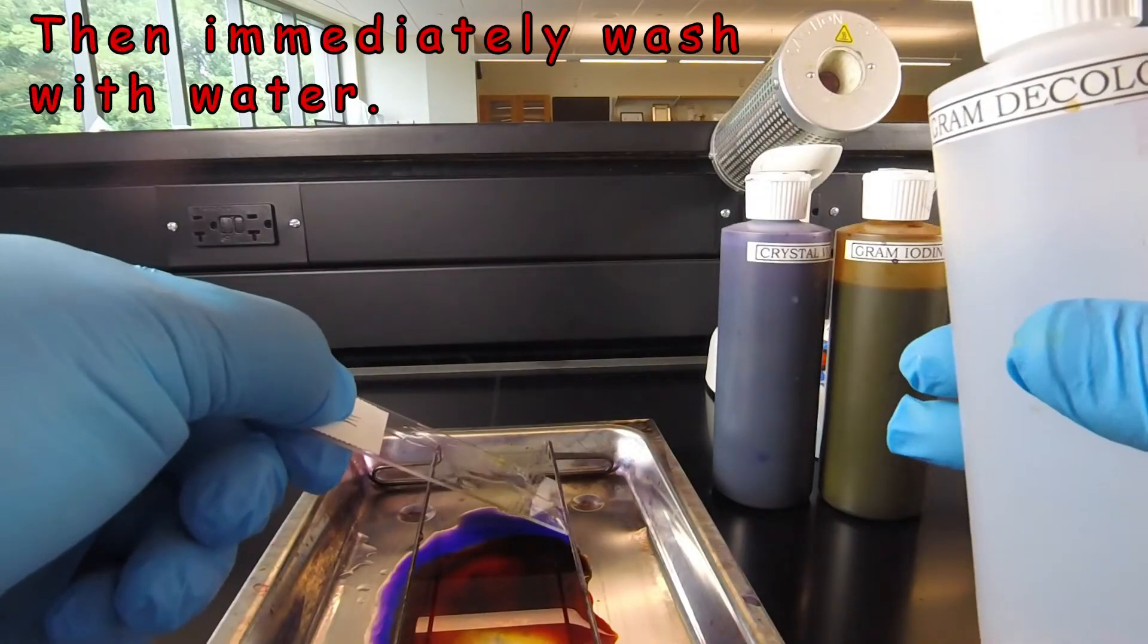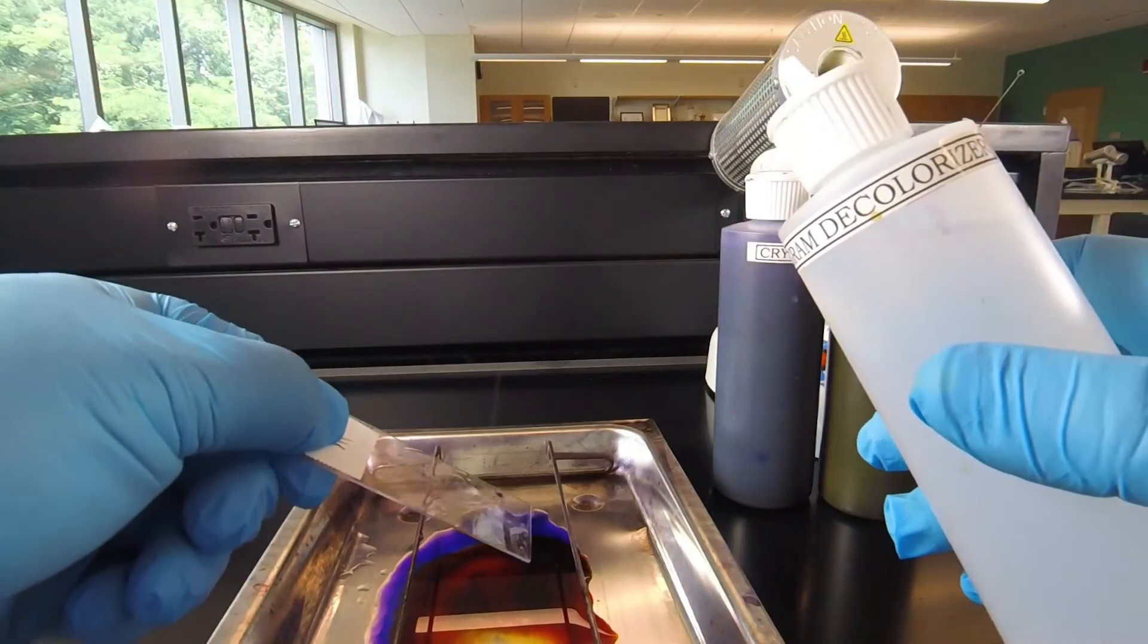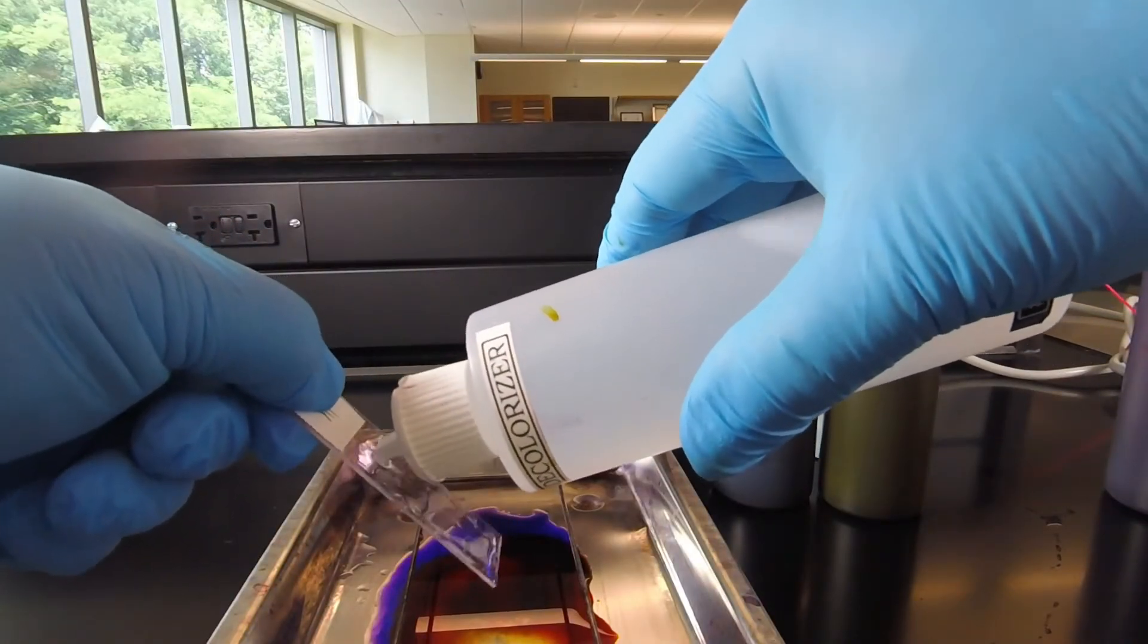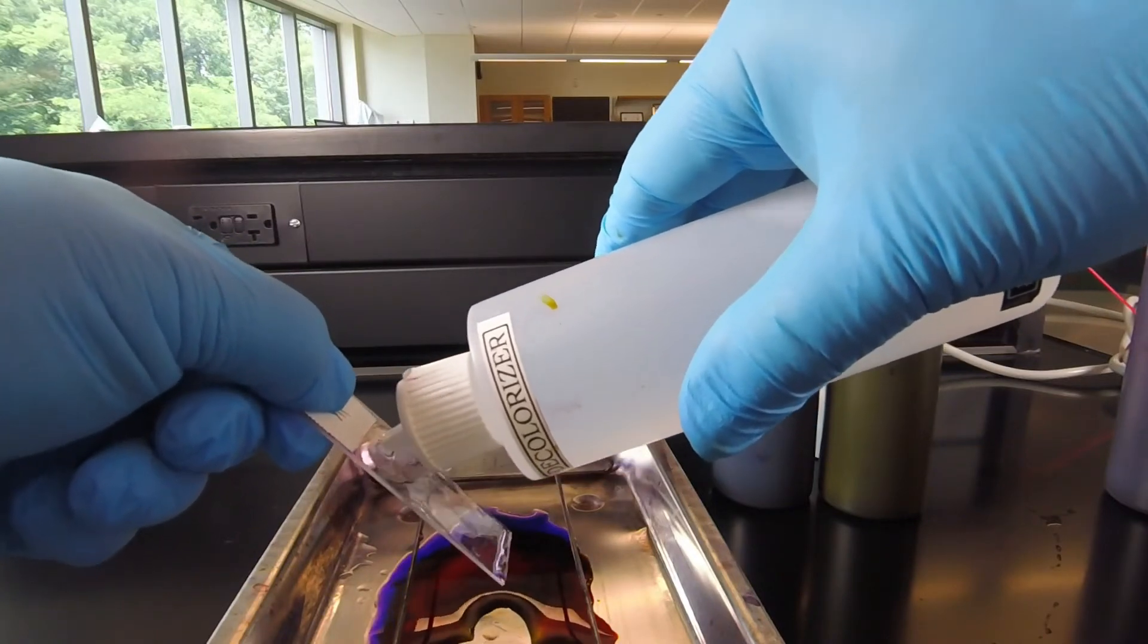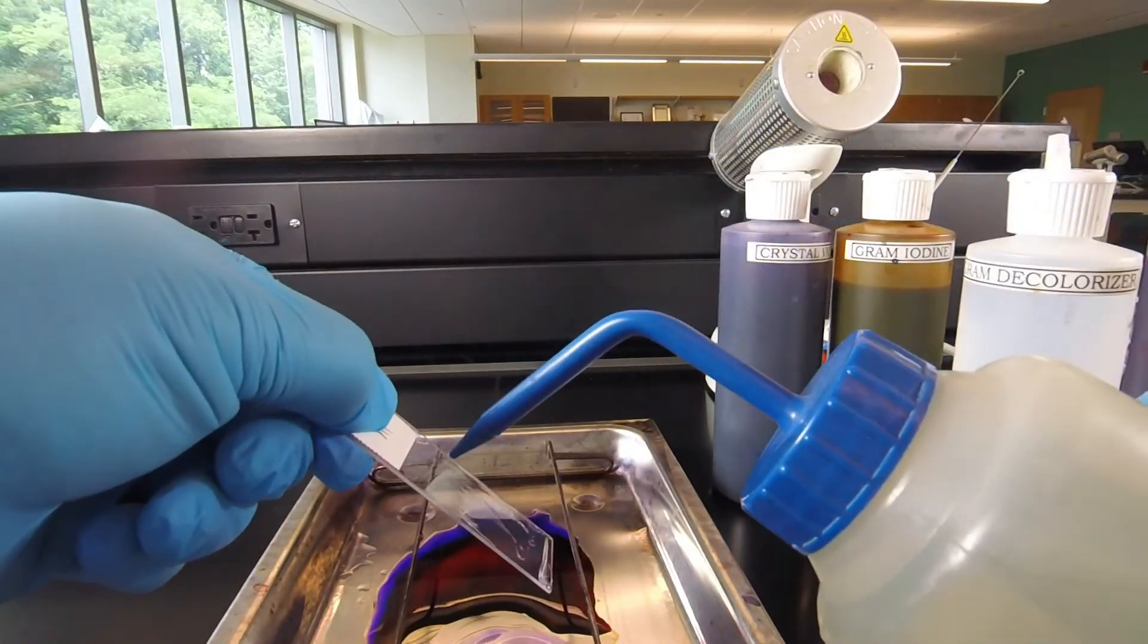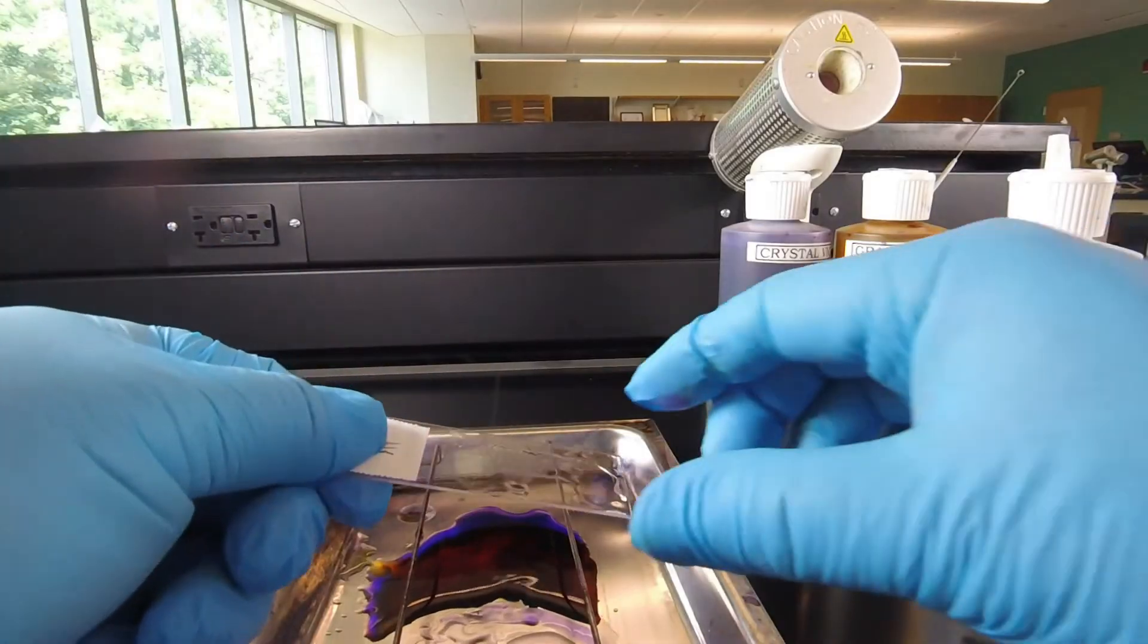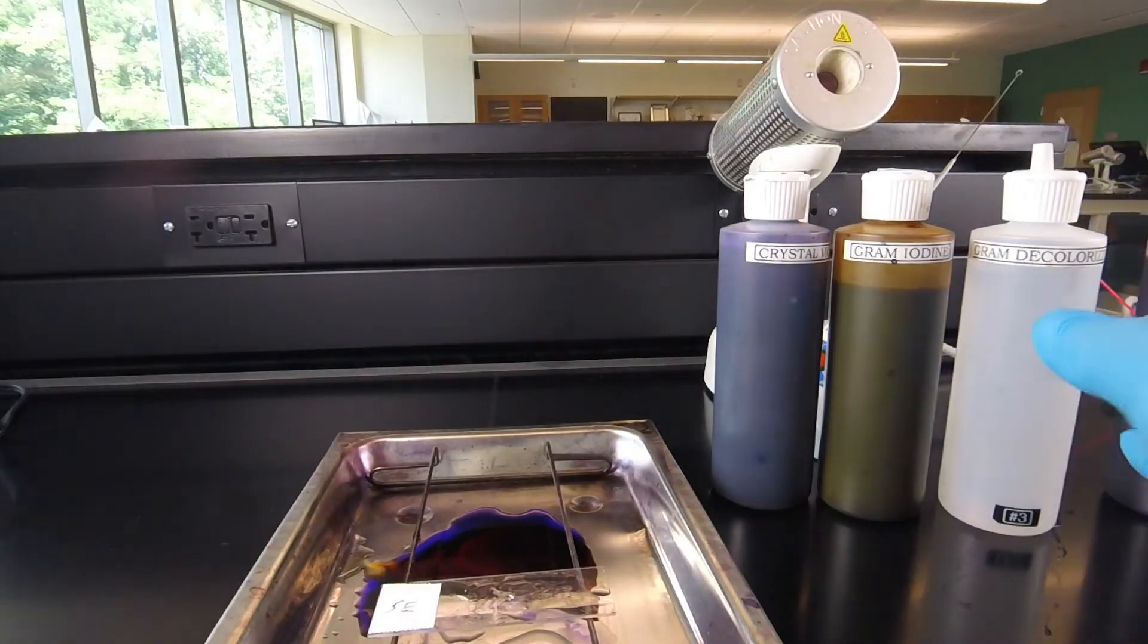As soon as the decolorizer coming off the bottom of the slide starts looking relatively clear, we immediately stop decolorizing and wash off the decolorizer with water. We're putting it back and forth. We see the purple coming off the bottom. Purple's still coming off. Now it looks clear. We take our wash bottle and wash off the decolorizer, shake off the excess water, put the slide back on the staining tray, and we're ready for our final step.